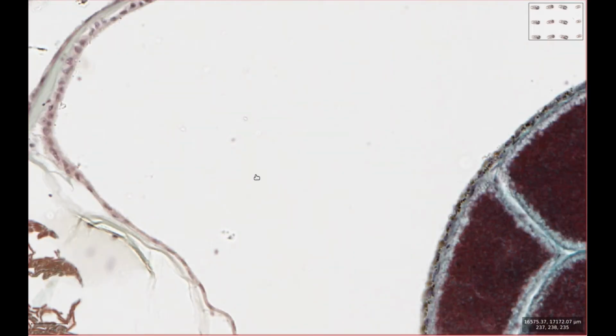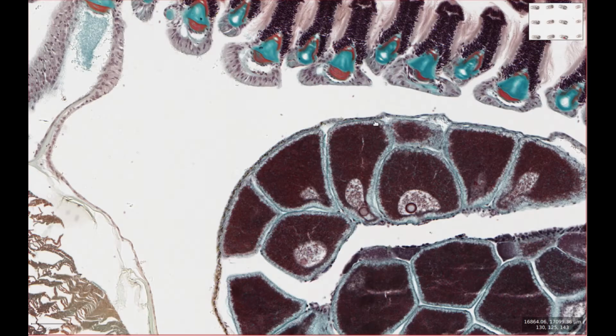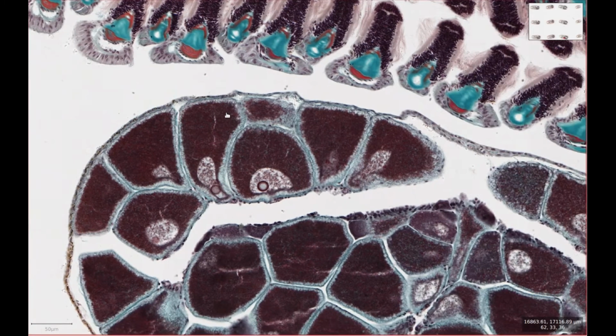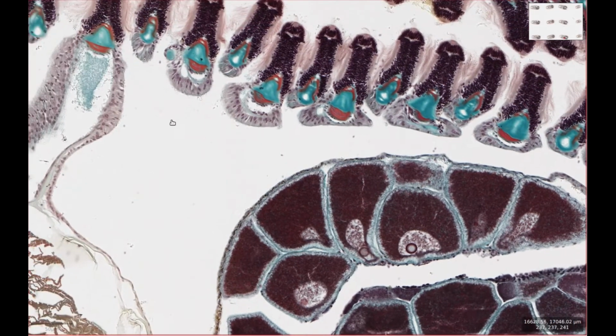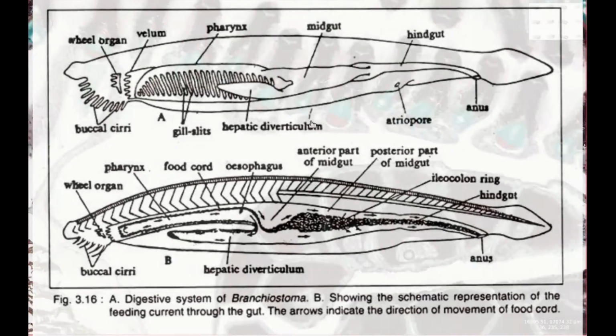So this is going to be separating the organs, such as the ovary here, from the water, which is going to be filled with all kinds of bacteria and other nasty stuff that you don't necessarily want to be entering into your body, or the Amphioxus's body, I should say. So water enters the atrium, and then towards the back of the Amphioxus there's a pore called the atriopore where it will leave again.